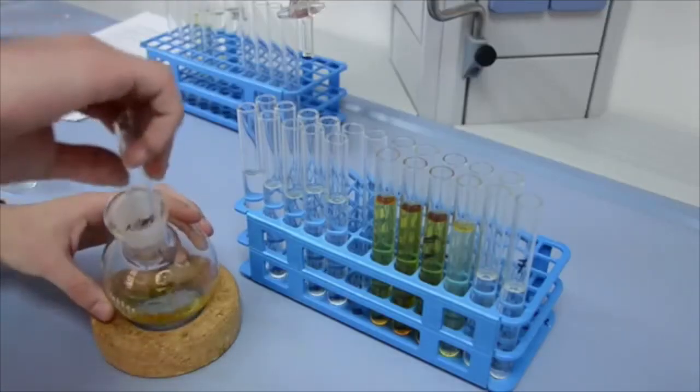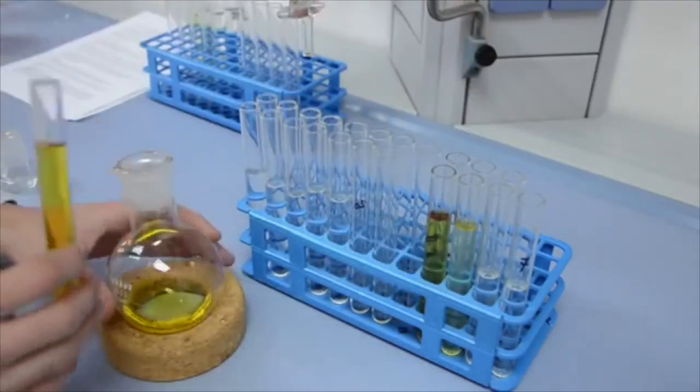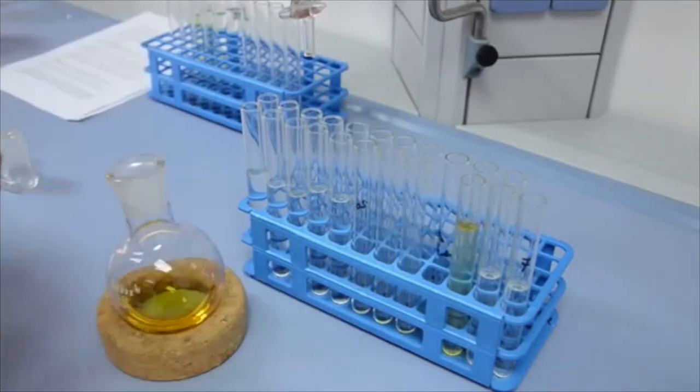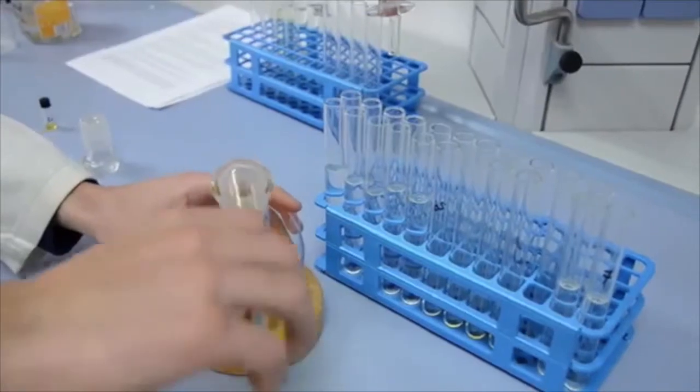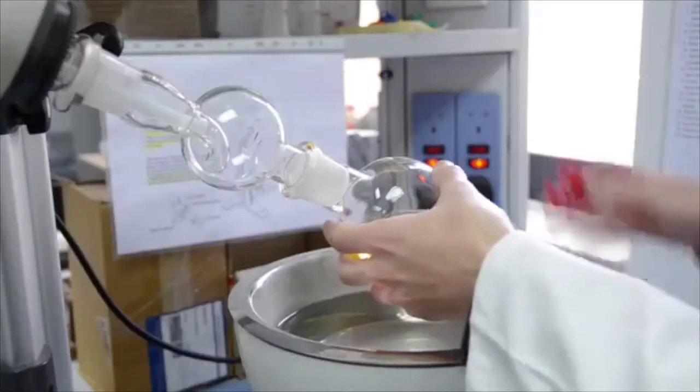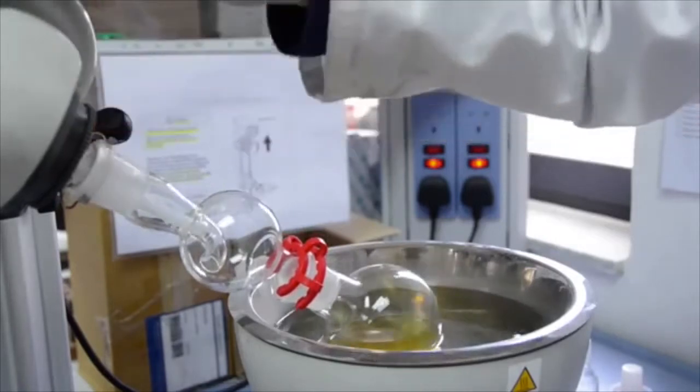Once the series of test tubes in which your product fraction elutes out is collected and you are sure that the contents are pure, pool the test tubes into a large round-bottomed flask and evaporate off most of the solvent. You can then subsequently transfer to smaller flasks as necessary as you go along.